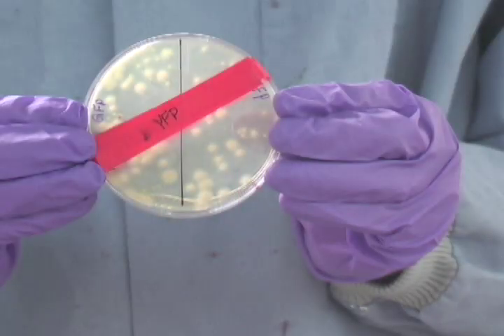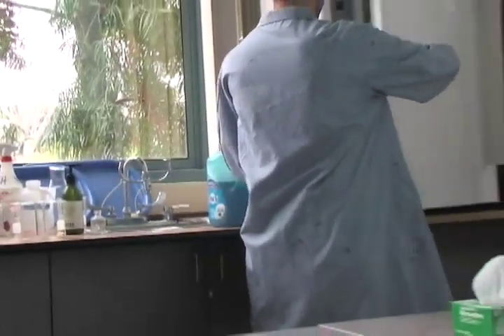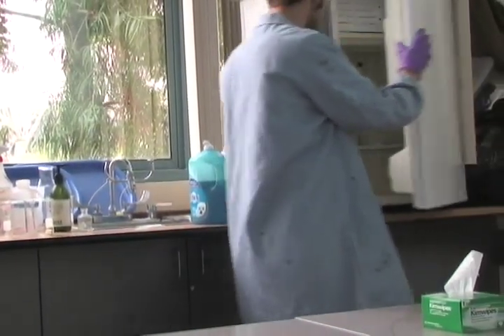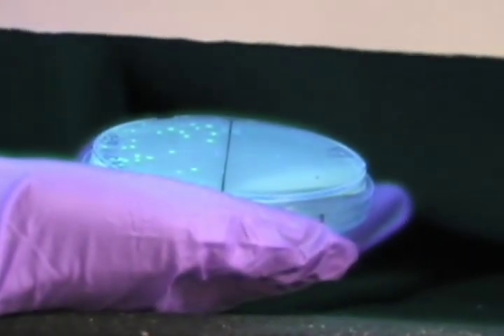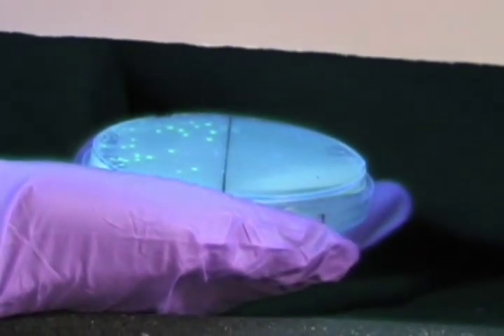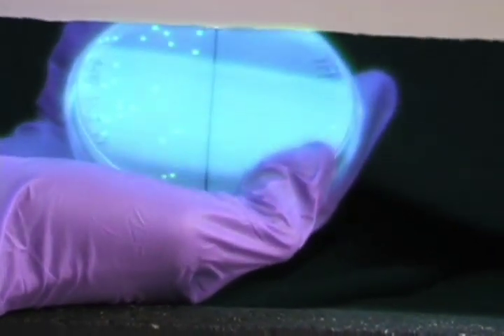Put your initials or group number on the plates. After that, place your plate in a 37 degrees Celsius bacterial incubation oven overnight to incubate. Tomorrow, we will use a long-wave UV light to visualize the transformed cells. Hopefully, you will see bacteria that fluoresce green and blue and yellow.